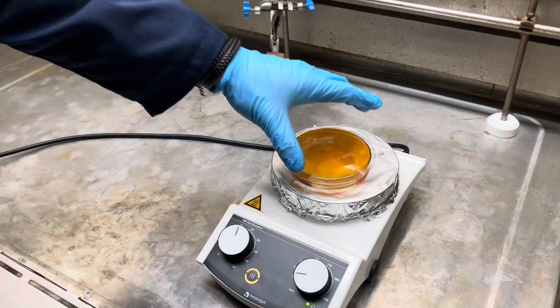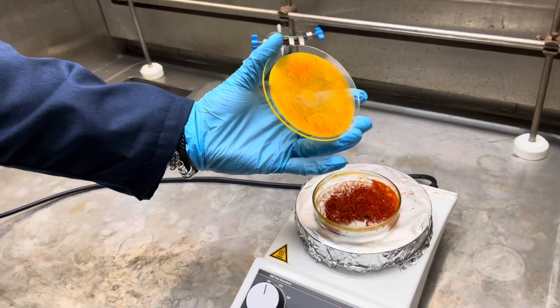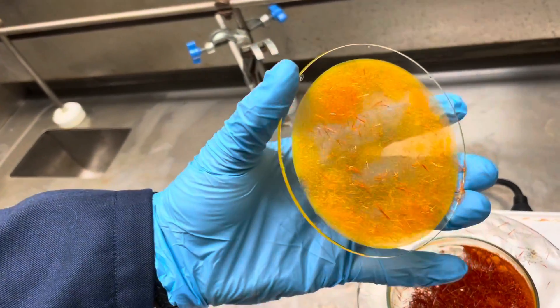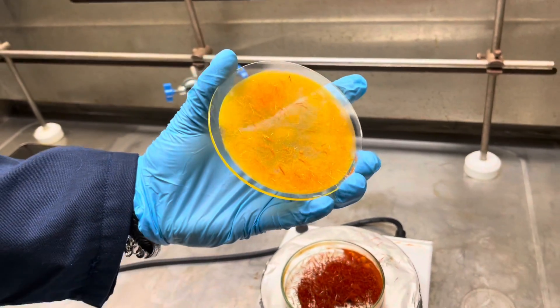Ultimately, what you should end up with is something like this: your pure sublimated ferrocene should sit on the lid, crystallite-like, and you can scrape it off the top lid and weigh it as pure ferrocene.